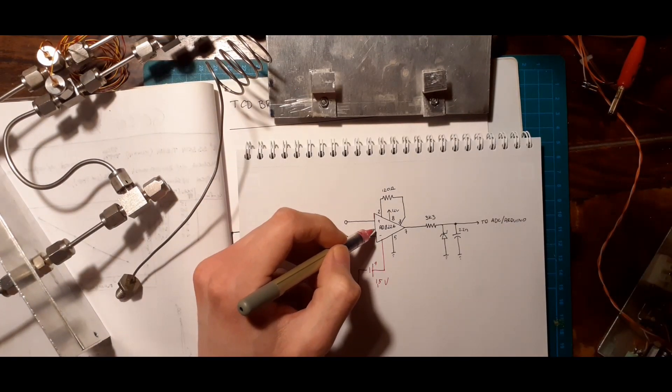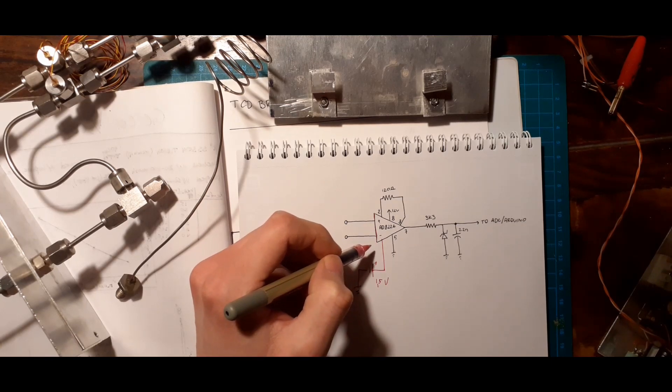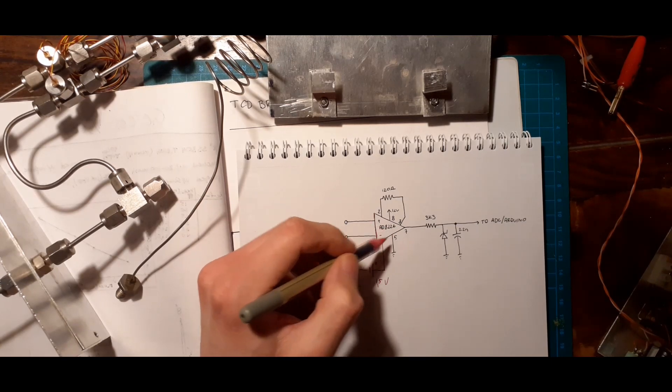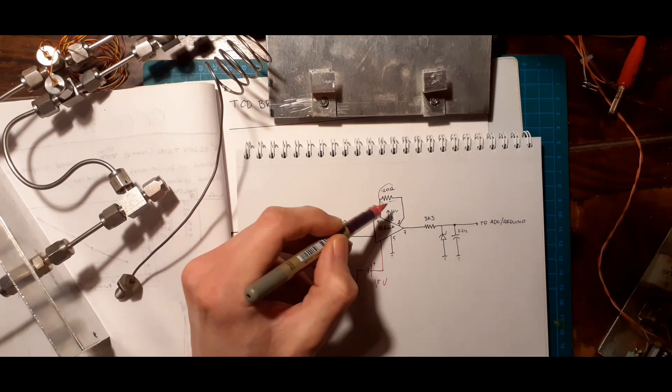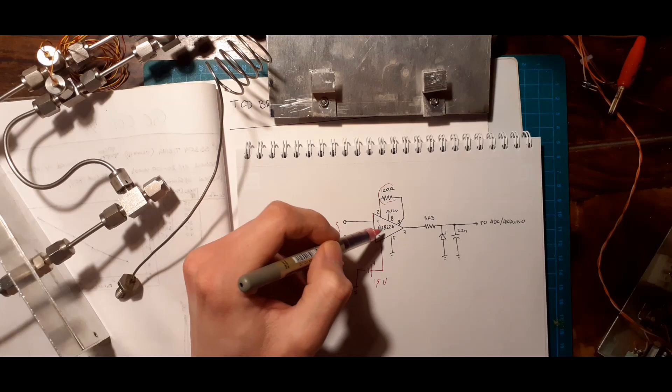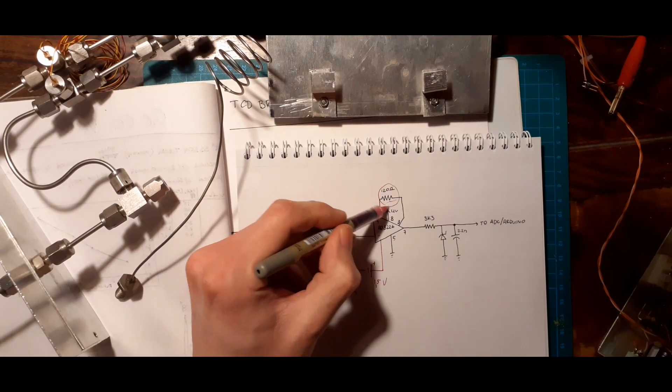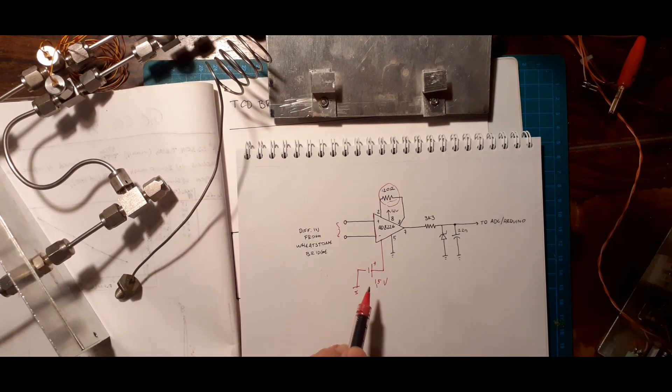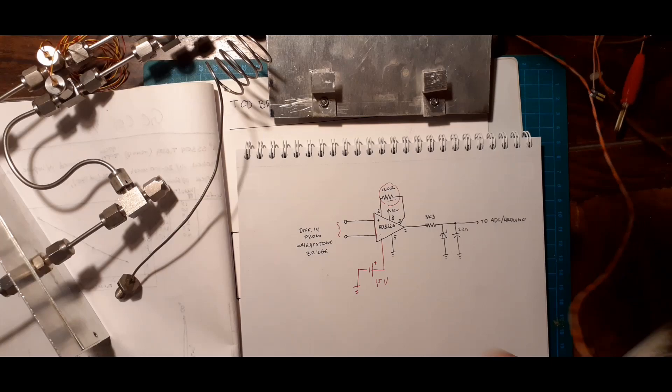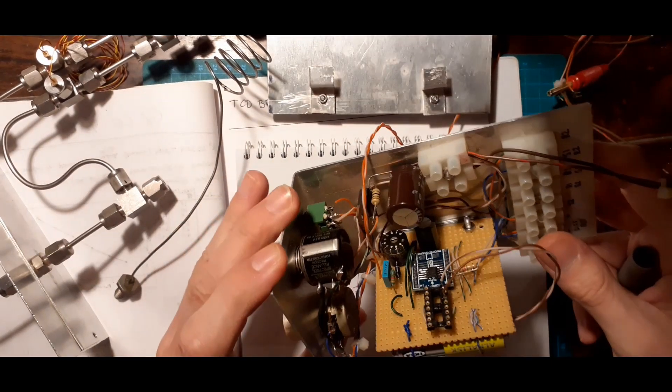This is an Analog Devices AD8226. This is called an Instrumentation Amplifier. This is basically three op-amps in one, and it's a differential amplifier between these two inputs here. It's very closely matched, all the resistance networks inside of it, and it's set up with a single resistor for gain. And you can give it a reference voltage in. I've chosen a reference voltage that isn't zero specifically, so I don't need to have a bipolar supply, simply because it's easier to handle.